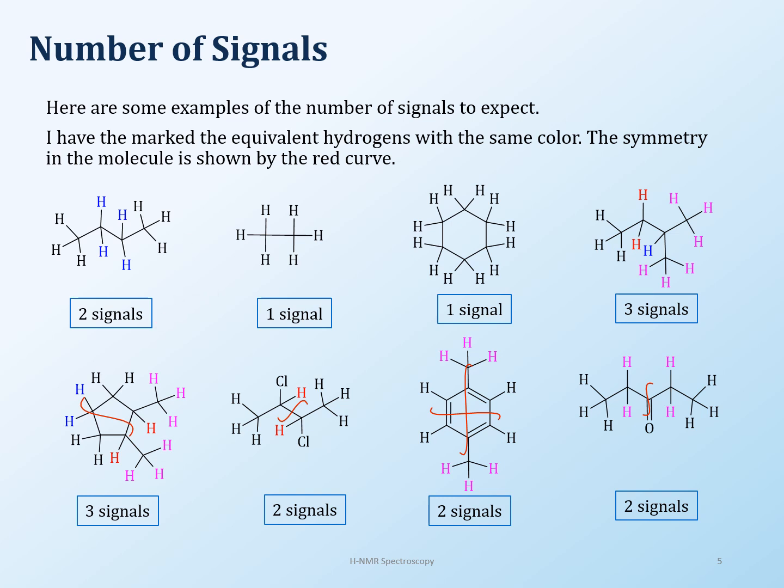The example I gave you first, when we started, was CH4, and that was methane. And I said to you, all of these protons are exactly the same because of the way they are connected. That carbon is going to be sp3, so every hydrogen is equivalent, which means what? It means you're going to see one signal in NMR.